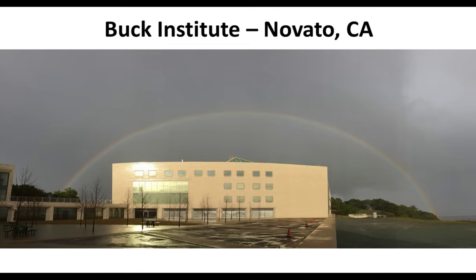identifying that many sites. We have actually worked with somebody before, Sam Payne is his name, on some of these E. coli projects and bacterial projects. They have actually done analysis just out of the regular lysate without enrichment. But for us, what is really important is not just identifying something, but mostly that we want to quantify them.